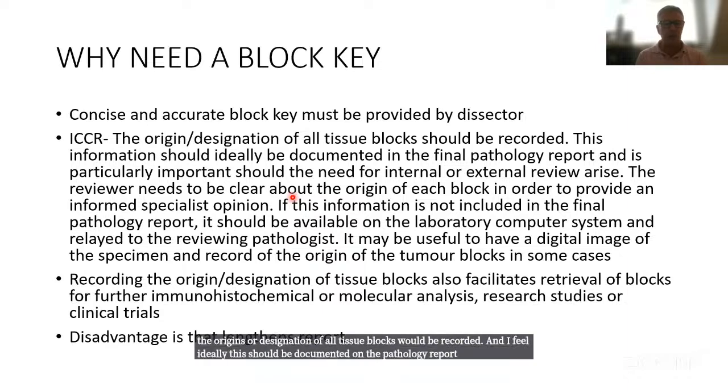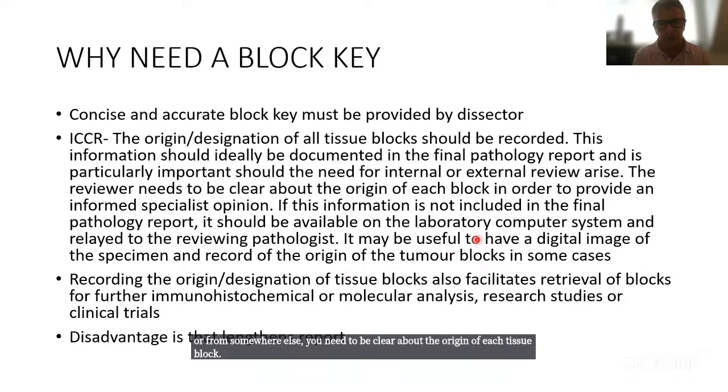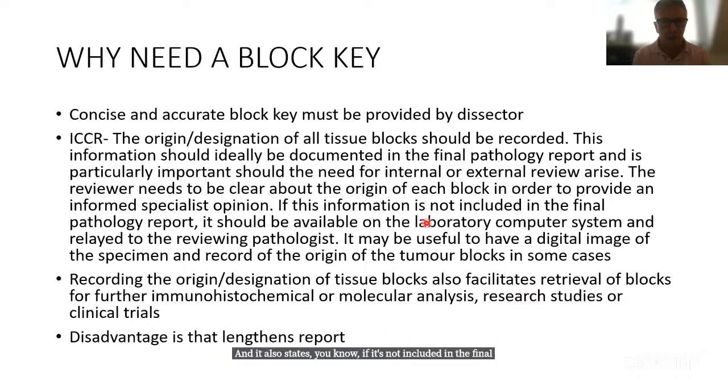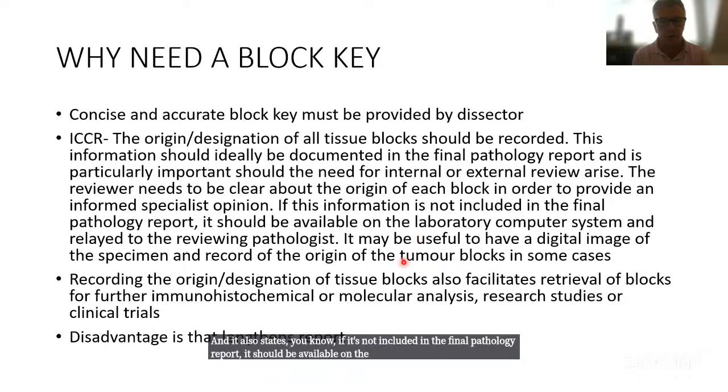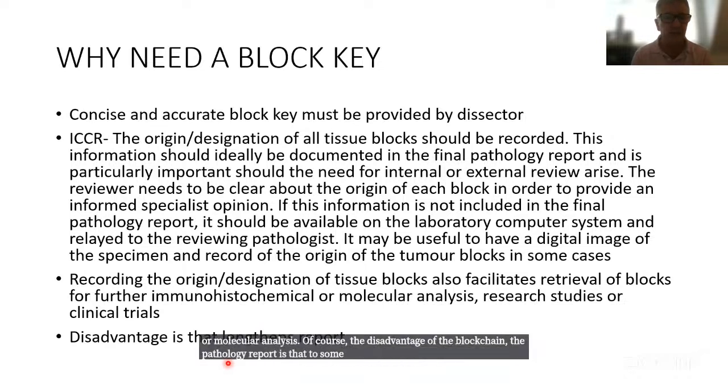This is particularly important if you're reviewing a case either within your own institution or from somewhere else. You need to be clear about the origin of each tissue block. It also states, if it's not included in the final pathology report, it should be available on the laboratory computer system and relayed to the reviewing pathologist. Recording the designation of tissue blocks makes it easier if you ever have to go back to get a tumor block, for example, for research studies or for further immunohistochemistry or molecular analysis.